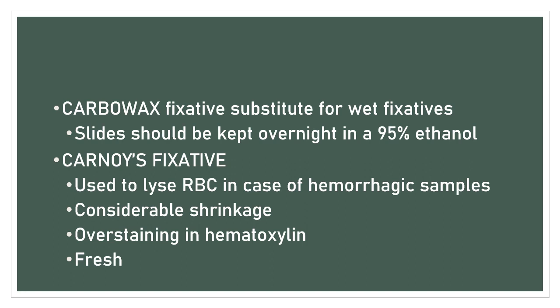And then you have your Carnoy's fluid. And so this one is used to lyse your RBC in case of hemorrhagic samples. And so your Carnoy's fixative is an excellent nuclear fixative, and then it preserves your glycogen.